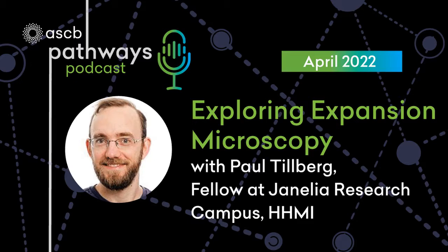Another example that I would like to mention comes from Josh Lillvis in Barry Dickson's lab here at Janelia, where they use, so we have, at Janelia, we've collected these amazing electron microscopy connectomes, where you can see every single synapse of every single neuron in an entire fly brain. Now that's incredible. It's an incredibly high quality data set, and people are going to be mining that thing for insights into cell biology and neural connectivity for years, maybe decades. But it's also just one fly brain.